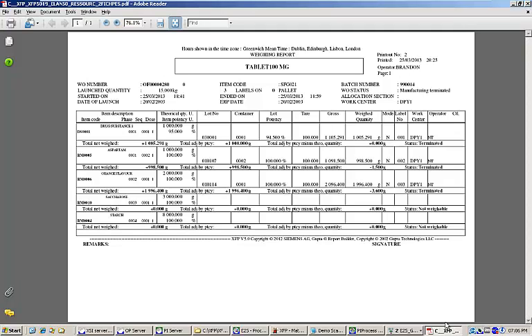Combined, all of these tools, alert review, EBR review, genealogy, system traces, and reporting, mean that you have greater visibility into and control over your process. As you can see, EBR is a highly flexible and extremely powerful system. It doesn't just allow for paperless manufacturing and collecting of data, it transforms that data into useful information and helps to increase overall quality and productivity.